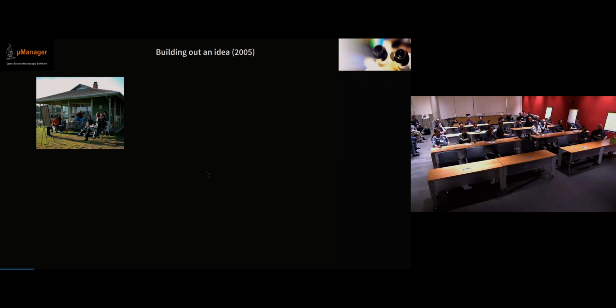We can write something. We can make that open source. We can make that freely available. And we can run all our microscopes in the lab with it. We can share it with the world. And we can do that in like 3 months or so. And Ron was smart enough to jump in and say, well, guys, that's a good idea, but you really should get someone who knows what he is doing. And we thought we knew what we were doing, but clearly we didn't really.